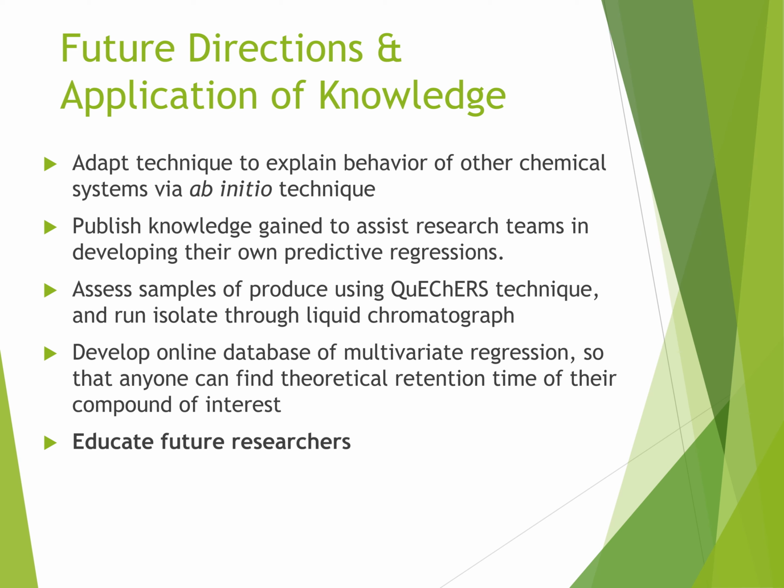We will be adapting this technique to explain the behavior of other chemical systems via ab initio technique. There is a focus on bioaccumulative, toxic, and persistent chemicals in our environment with this research. We want to publish the knowledge gained to assist research teams in developing their own predictive regressions. We will be assessing samples of produce using the QuEChERS technique, and we will run the isolate through our liquid chromatograph.